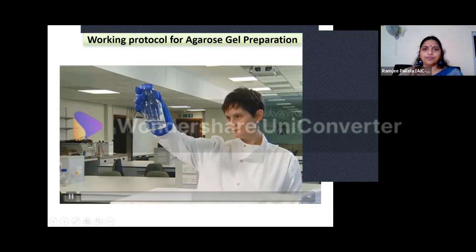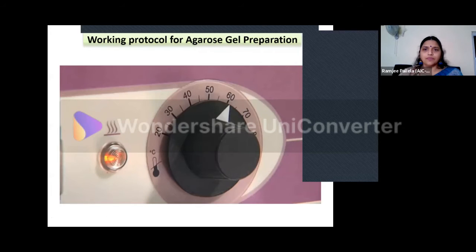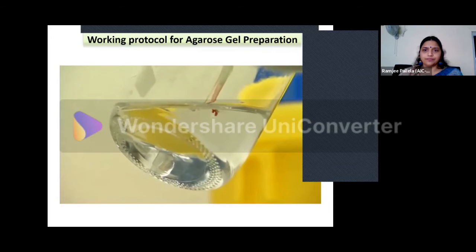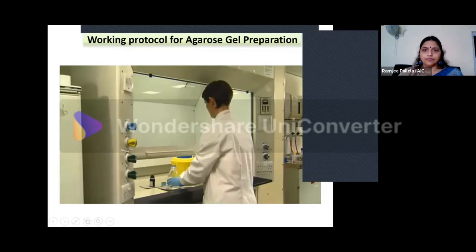Okay. Once the agarose is cooled, you'll need to add a dye to the molten gel for later visualization of the size-separated nucleic acid fragments. You can use SYBR Green, but the best and most commonly used dye is ethidium bromide. When using ethidium bromide, you should always wear gloves, since it's a mutagen and a possible carcinogen.